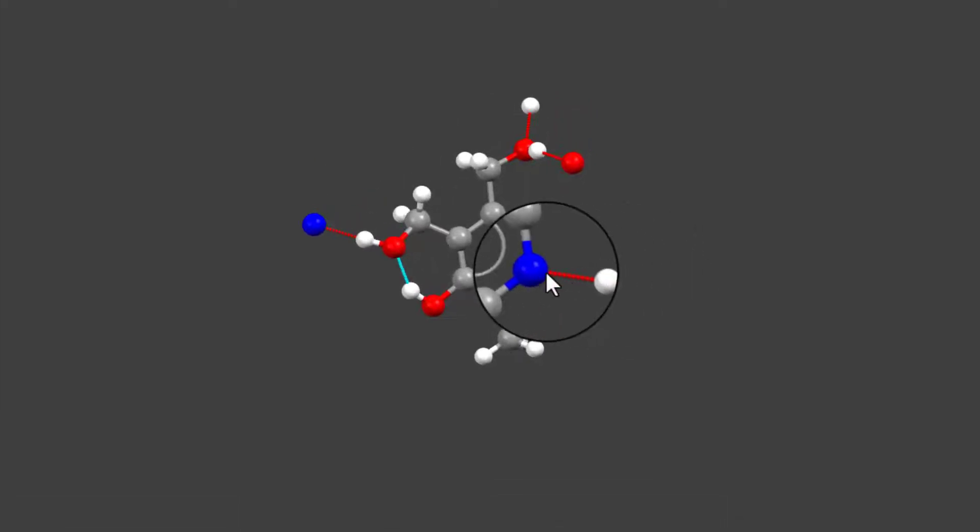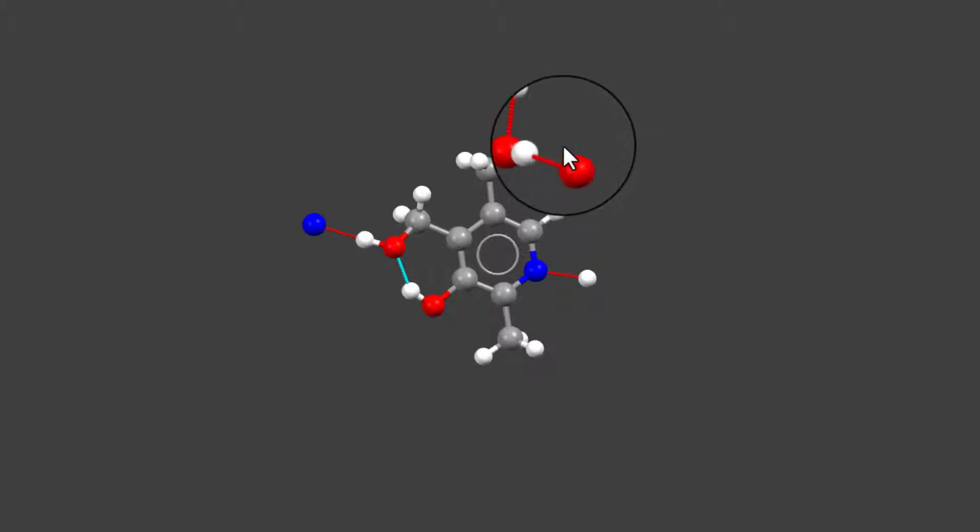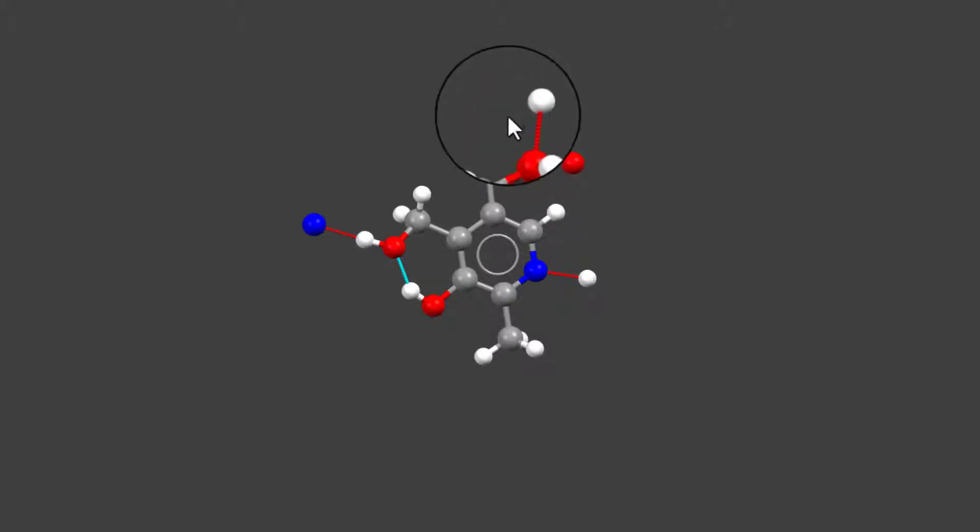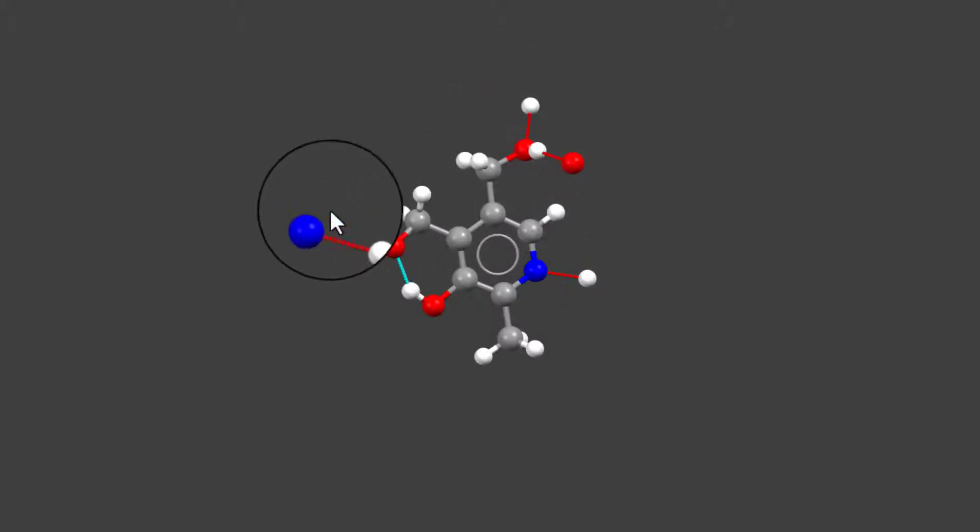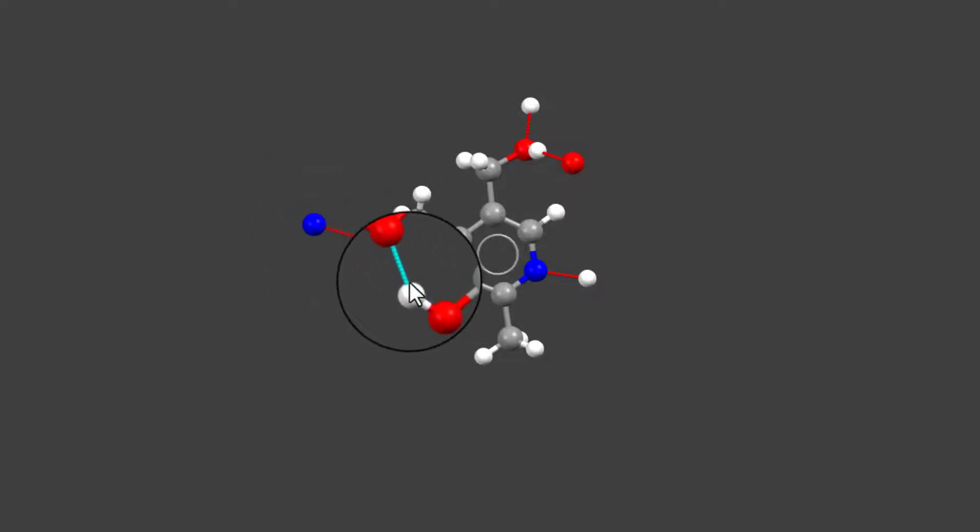Hydrogen bonds appear as dotted lines with the contact atom hanging at the end of it. We can observe that the pyridoxine molecule in this structure forms five hydrogen bonds, one of which is intramolecular.